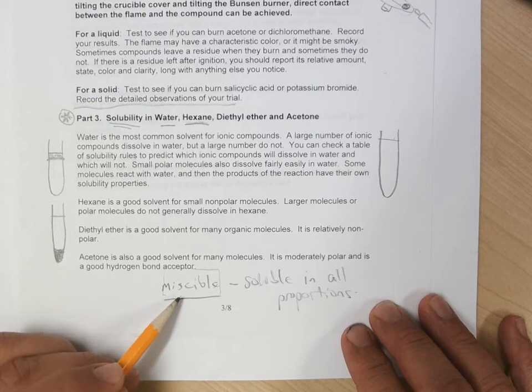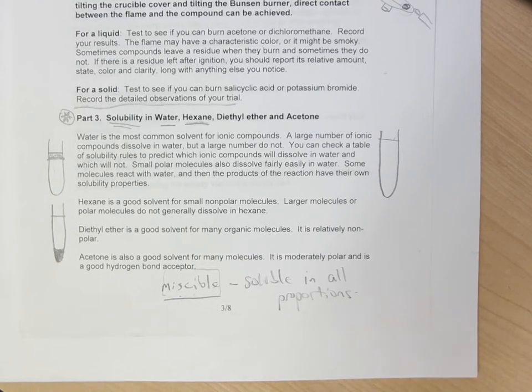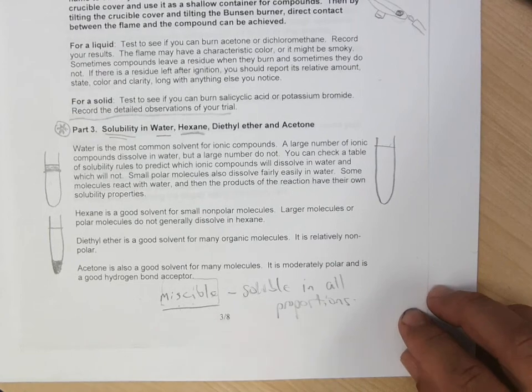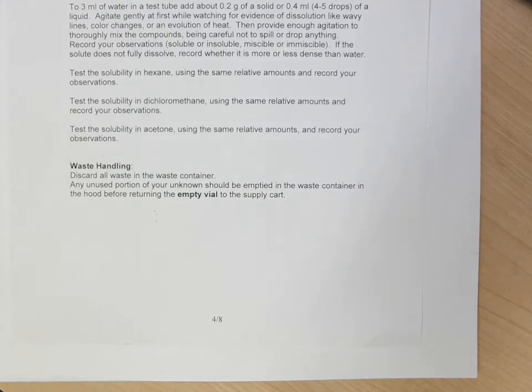We're not going to try all different proportions, so the use of the word miscible would be ill-advised in reporting our observations here, unless we tried all different combinations of amounts of the two liquids. That's something in previous courses they say: if a liquid dissolves in another liquid, we call it miscible, but to be miscible you have to be soluble in all proportions. So it's very interesting to see whether things dissolve or not.